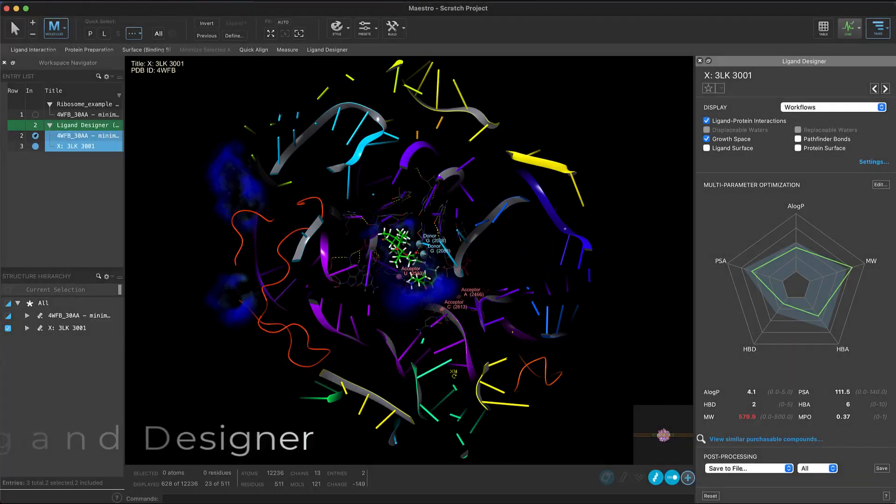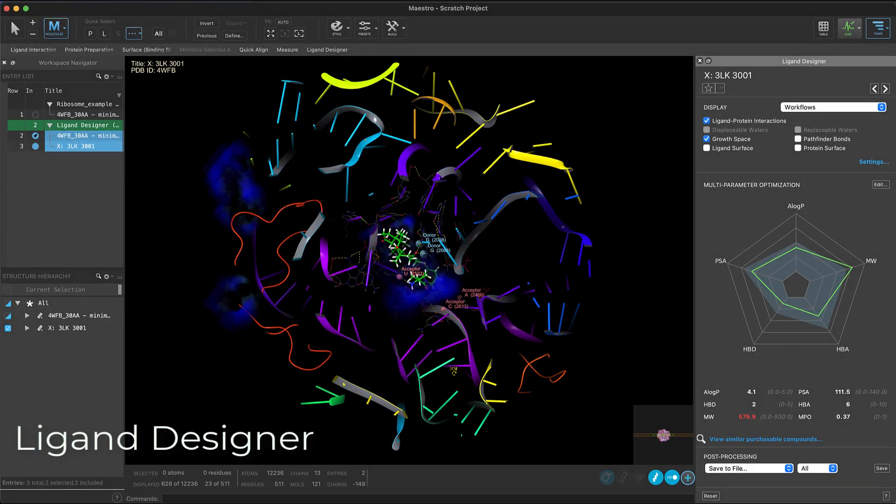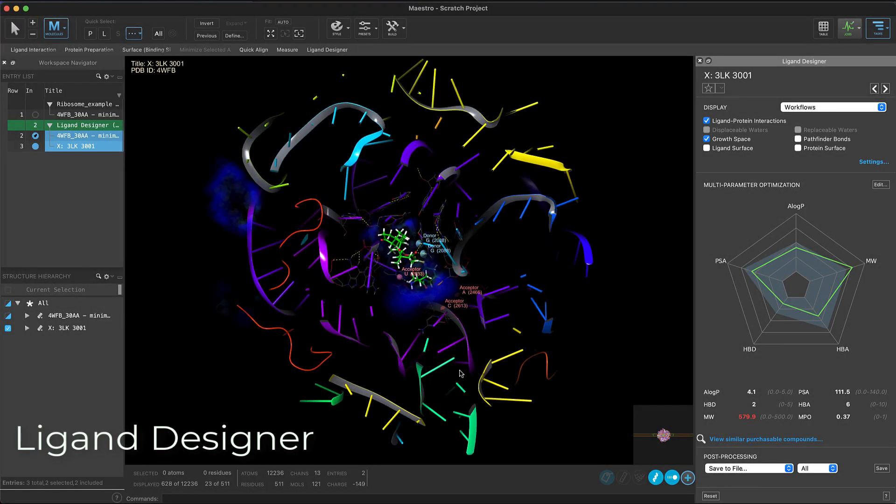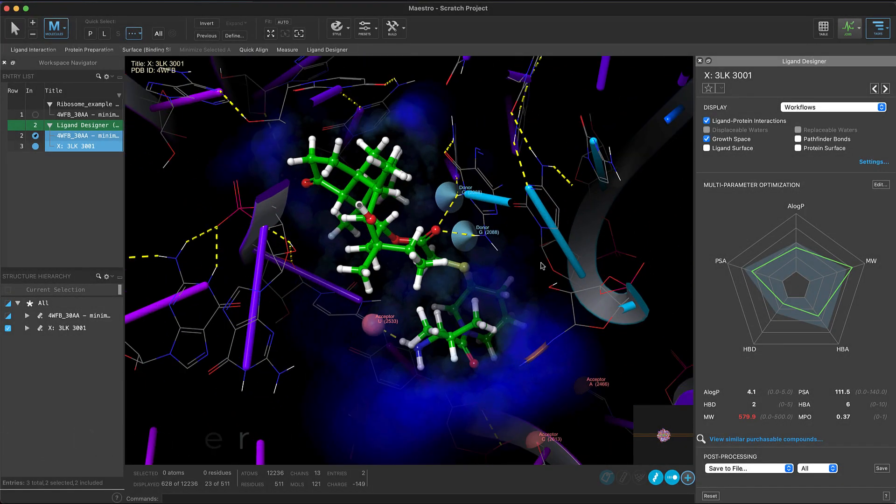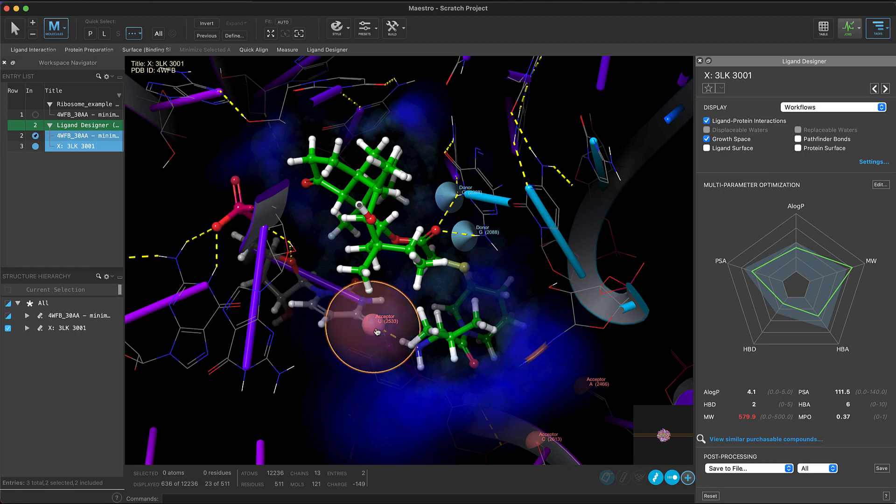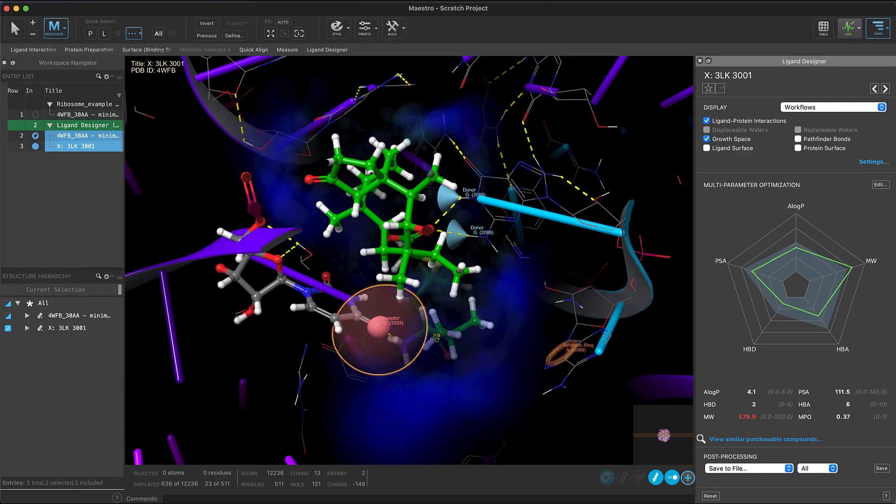Over in the ligand designer, we've expanded support to non-protein receptors such as ligand RNA complexes, where one can visualize growth space renderings and potential ligand RNA interactions.